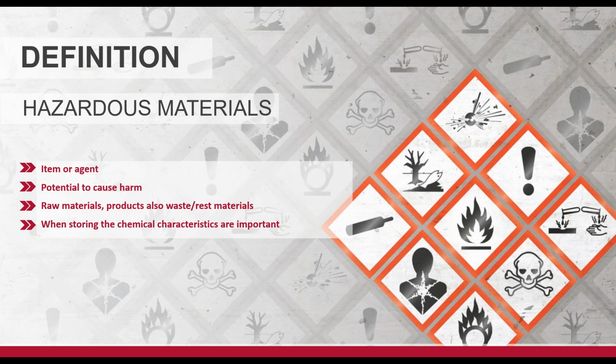We also have to pay attention to a couple different varieties of that hazardous material. So how does it act as a raw material as they bring it in the facility? What kind of products are made out of it? What's it mixed with? What does it become? But also in its waste, right? So maximal allowable quantities of flammables can't be reached or overshot. But we have to understand it is all three of those that really drive what that means.